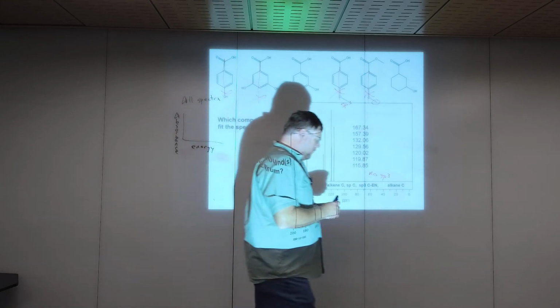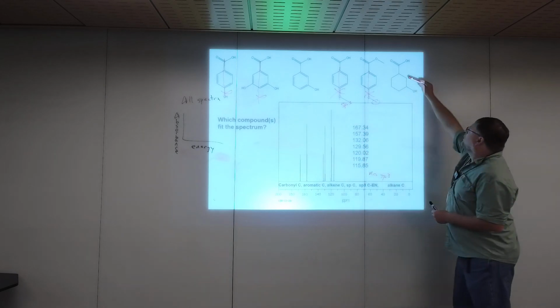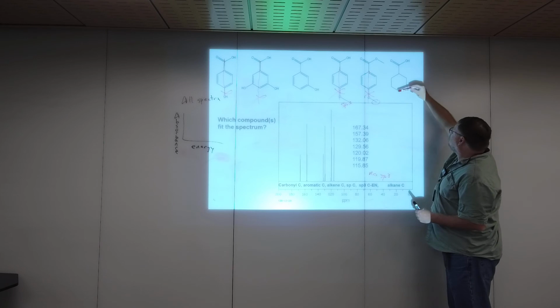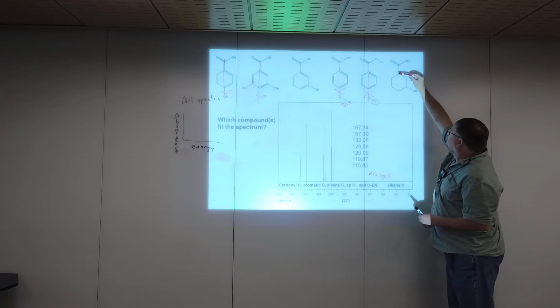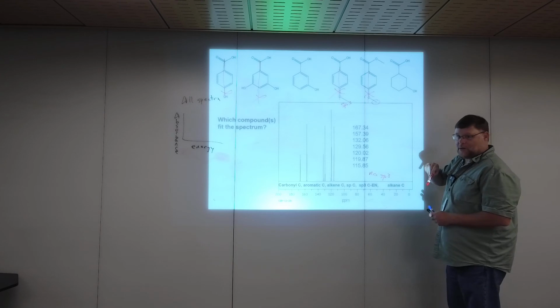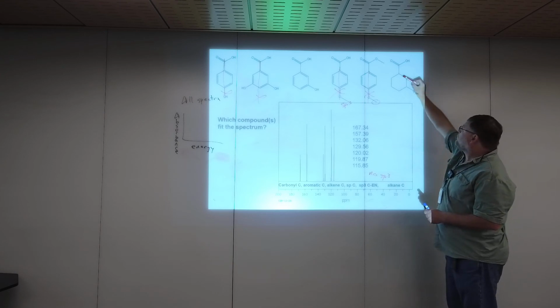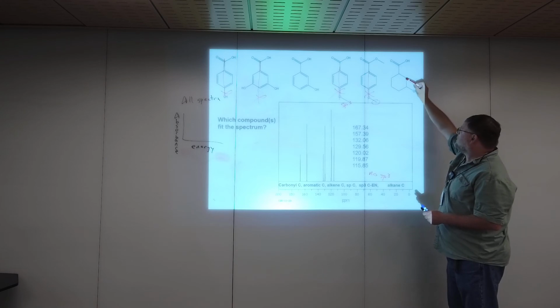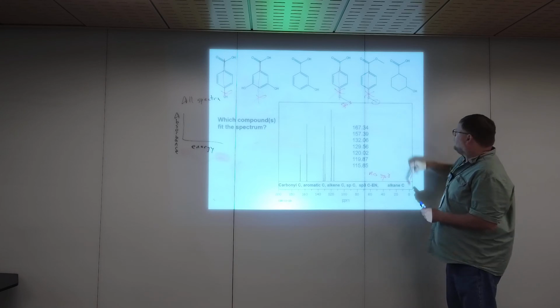How about the one on the far right? So 1, 2, well, okay, there's no plane of symmetry. 1, 2, 3, 4, 5, 6, 7. 7 carbons, good. But these are all sp3, right? 6-membered rings aren't benzenes necessarily. You have to have double bonds. These are all sp3 hybridized. There's none.